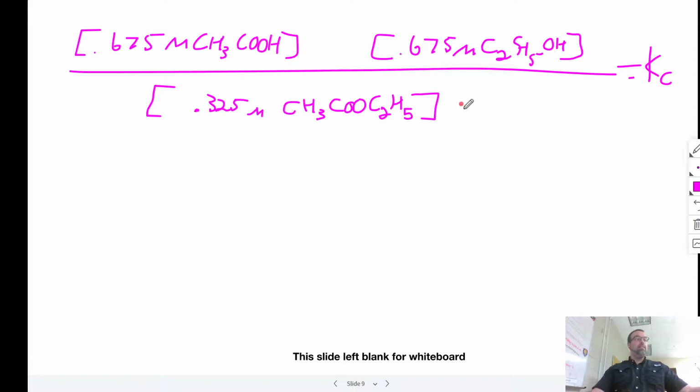In the document, it does tell us to use water. Since water is in excess, though, it's not really useful for us in our calculations here. So at part G, I would like you to solve it, but please do not use that in your equilibrium expression, as it will end up messing with your equilibrium expression.